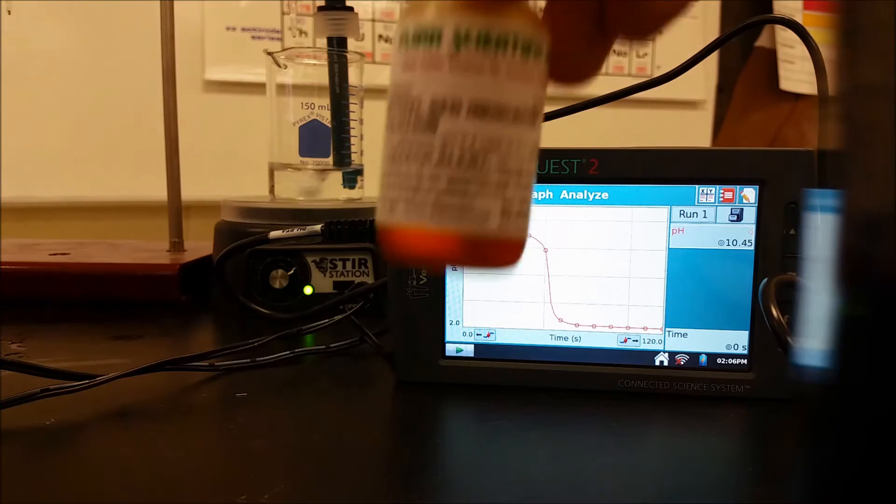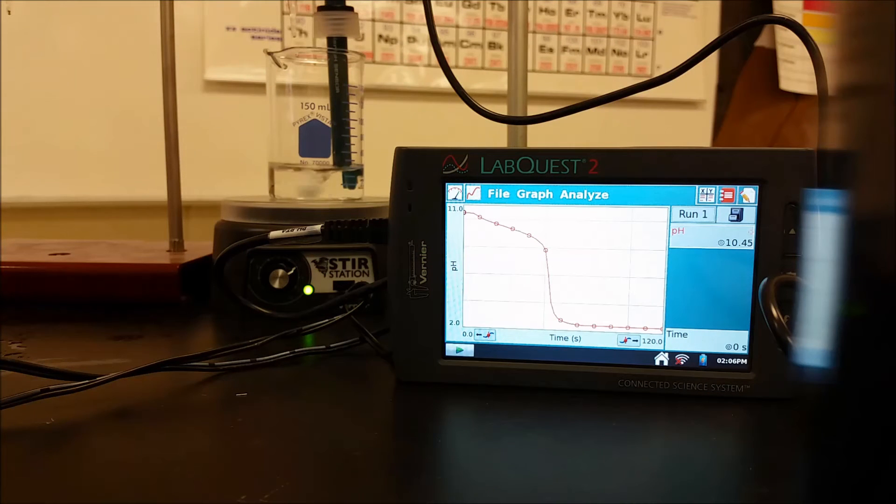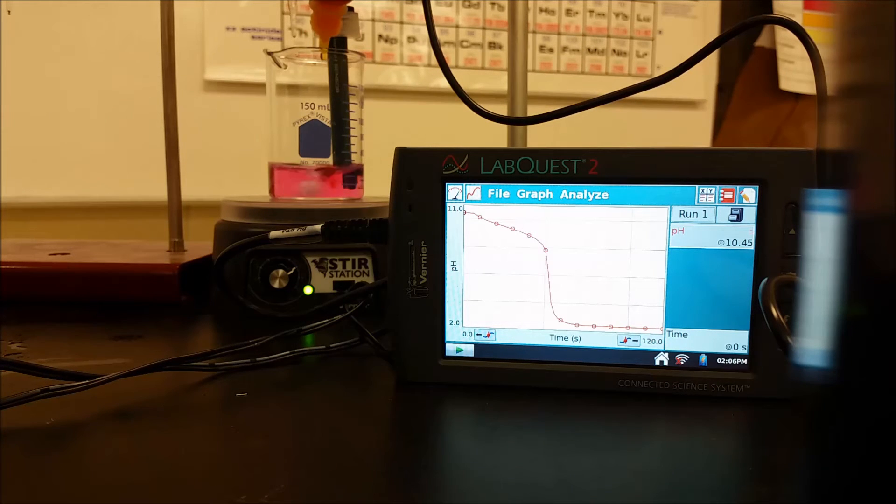Here I'm going to take an acid-base indicator called methyl red and I'm going to add it to a weak acid solution of acetic acid. Acetic acid is 0.1 molar, it's 10 milliliters, and then I've diluted it a little bit with some distilled water to fully cover the pH meter.